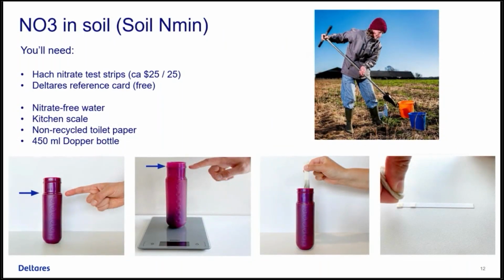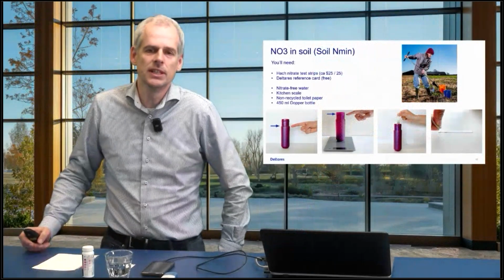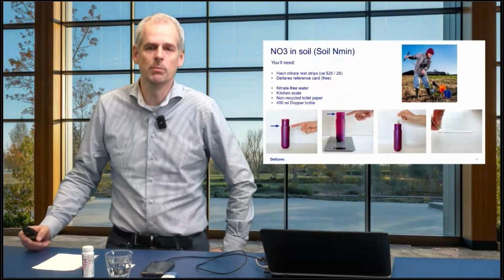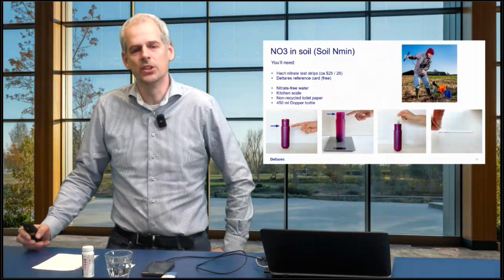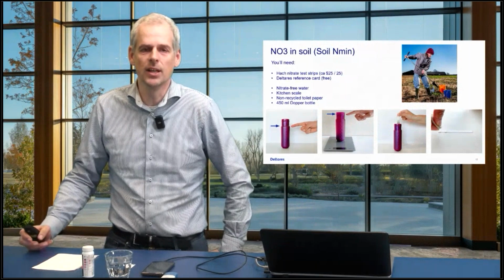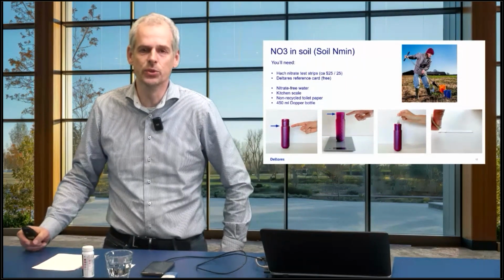Upon request by many farmers, who wanted to measure nitrate, they also liked a lot the opportunity to measure nitrate in the soil, because the upper soil is most crucial for them to grow crops. So if you can measure the nitrogen or nitrate content in the soil, that can be interesting for farmers. They can have a look if it's needed to apply more manure or fertilizer, and also at the end of the season they can see, okay, is there still some left, or did I tune it very well, and is everything used by the crops?